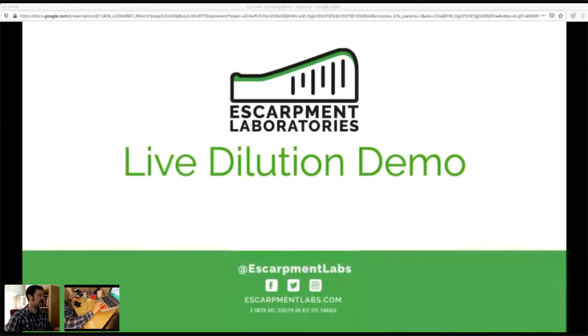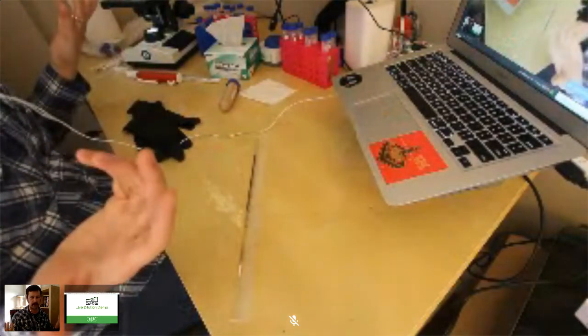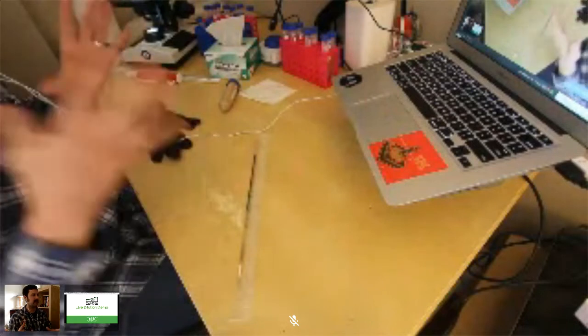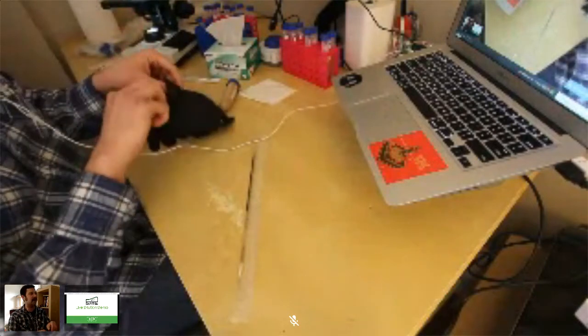Now, the quality of this stream isn't very great. I'm running it through a USB port, so the quality isn't great. You'll be able to see the work happening. It's pretty artifacted, I'm sorry about that, but I'm going to mostly show the technique, and you should be able to get that from this. So whenever we are doing lab work, make sure you're wearing gloves.